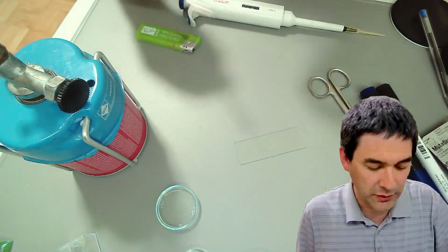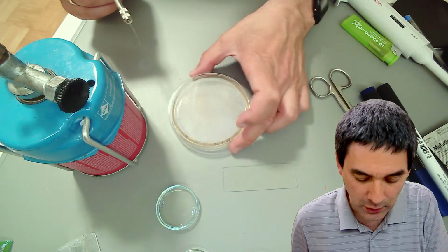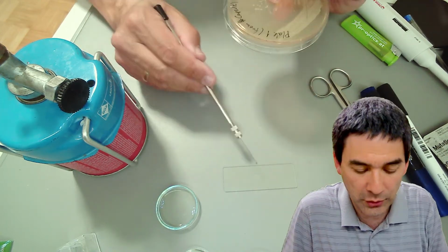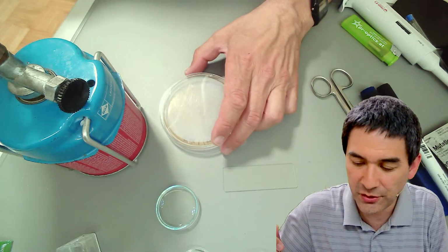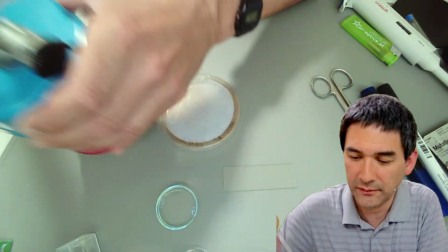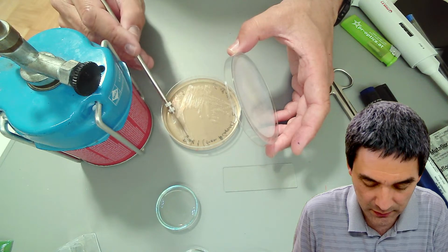And I'm going to do the following. I'm going to take this plate over here, pick off one colony, and put the colony into the water. It doesn't even have to be a colony. I can take some off from the side here as well. I'm holding the loop into the flame again. So let's cool it off again. Let's pick some material off here.